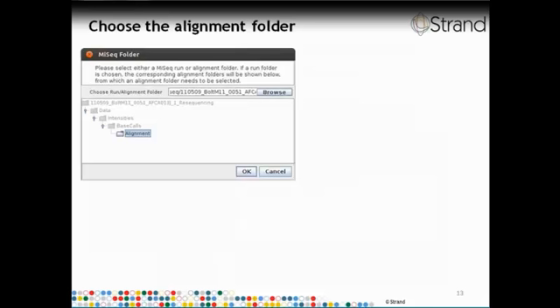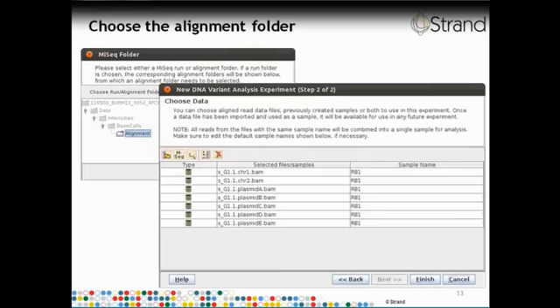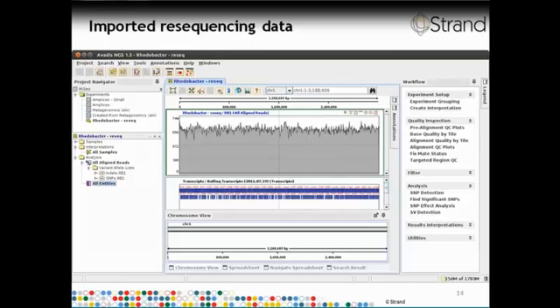When importing the VCF files which contain the DNA variants, extra columns are added to each variant allele, which allow further downstream filtering and analysis. To be more specific, 4 extra columns are added. For each variant allele, we add a column which indicates the total number of reads which are spanning the allele location in the read file. We also add the percentage of those reads which are supporting the variant allele and the percentage of the reads which are differing from the reference. And finally, since we may wish to filter based on the strand bias, the strand bias column is also added. So all of these 4 columns are added automatically when the VCF files are being imported.